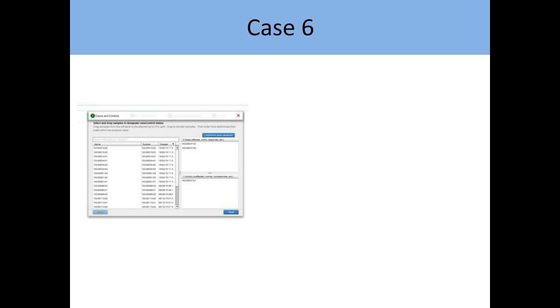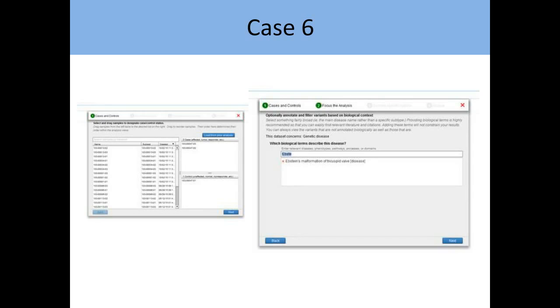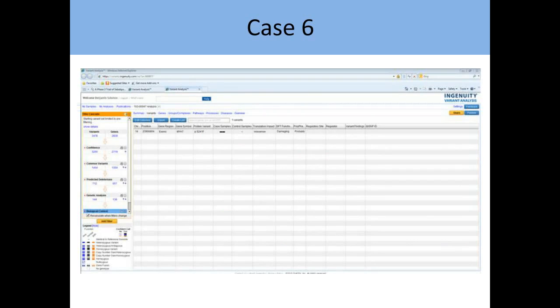We just dragged and dropped the genomic files from there, and that's what that screenshot is showing you. And then I just typed in one clinical thing. I just typed in Ebstein's anomaly and put it in there. And again, I hit analyze, got up for 30 seconds or so to get a snack, sat back down, and I had the right answer, which was a mutation in MYH7 in this case that both the child and the dad had.